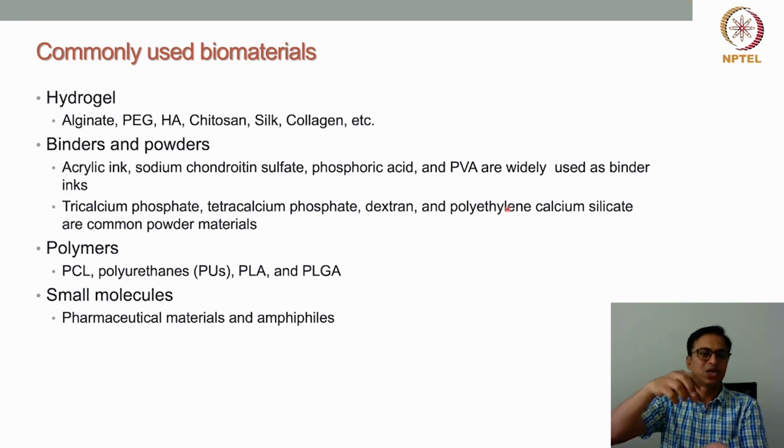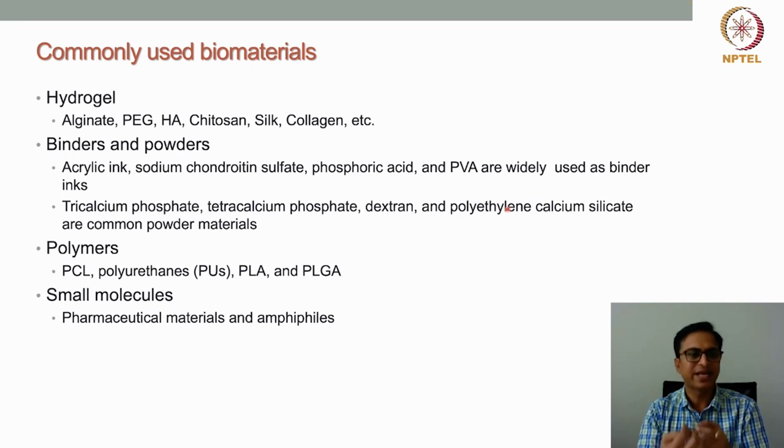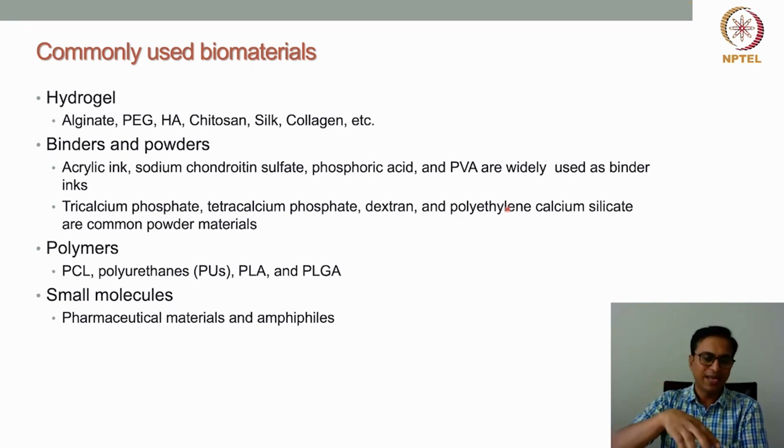The binders come out of the nozzles as droplets, and those droplets will go and stick to the powder bed, and there we control their positioning. Suppose we put them at certain locations of this powder bed, then these binders will bind the powder material at those pre-designed locations or coordinates. In this way also we can prepare 3D structures, right?